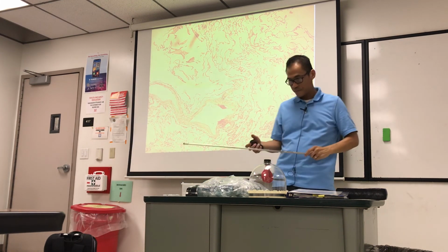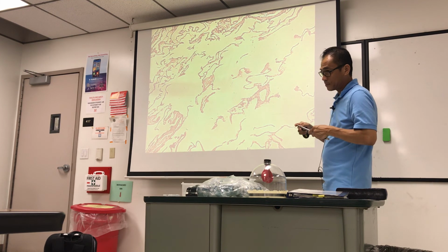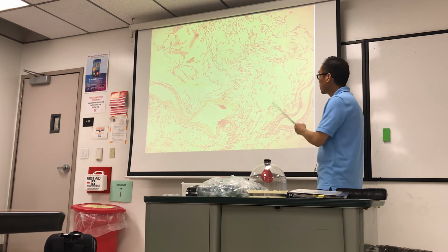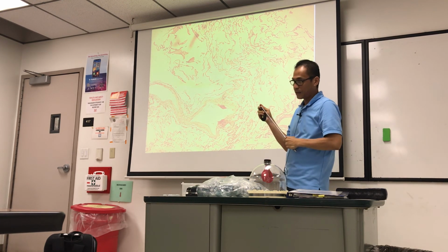When you show us this one, what would be a question you would ask on this, just to describe what the slide is of? Yeah, I'd probably go for emphysema. But would you have us point out things that are on there? No, there's really nothing to see, except the very large alveoli. Mostly that the whole thing, this is what emphysema lung looks like under the microscope.